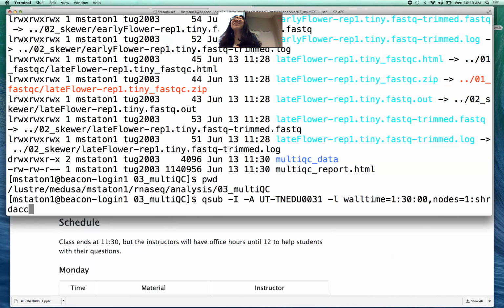Hi, everyone. We'll start the next part. So what we are doing right now, we will map our reads to the reference genome. We are using a peach genome, which is very similar to apricot. We don't have an apricot genome yet. That's why we're doing a similar species mapping.